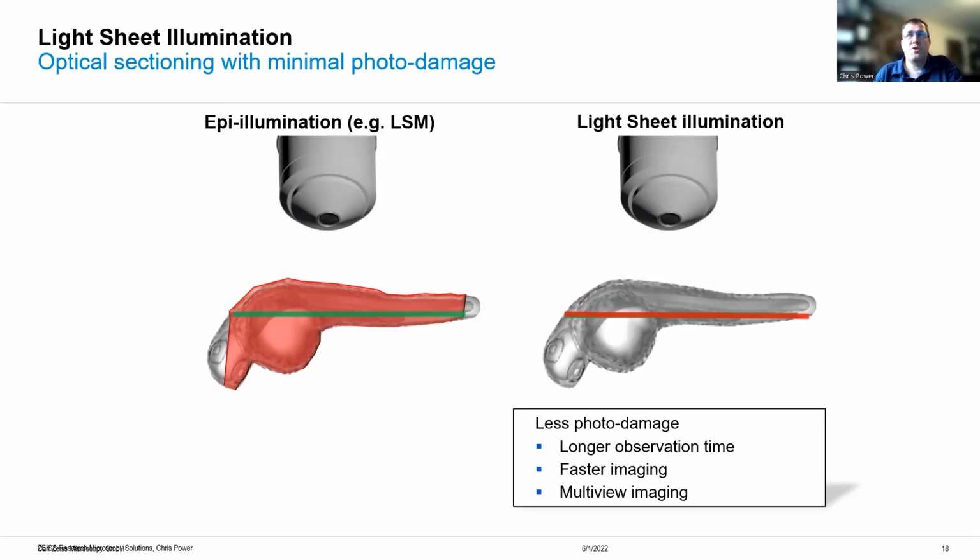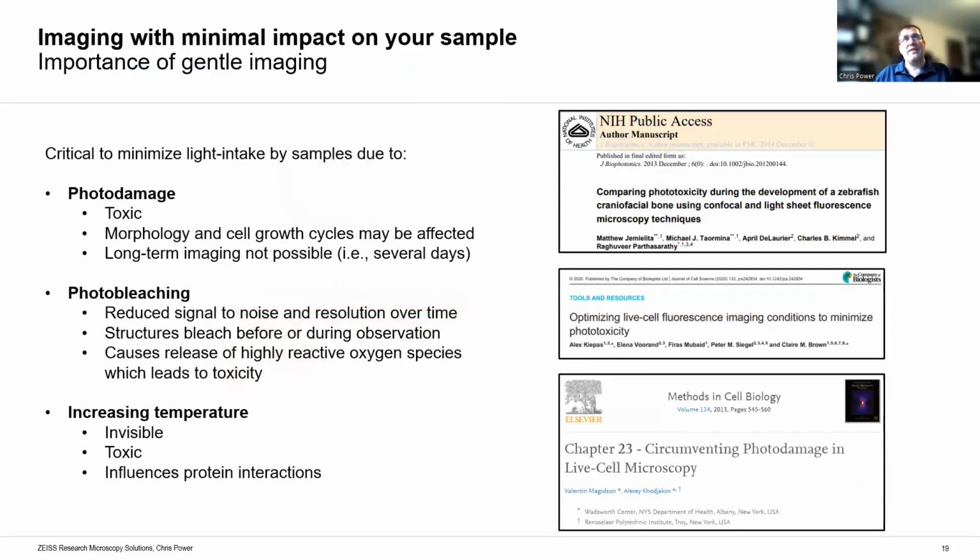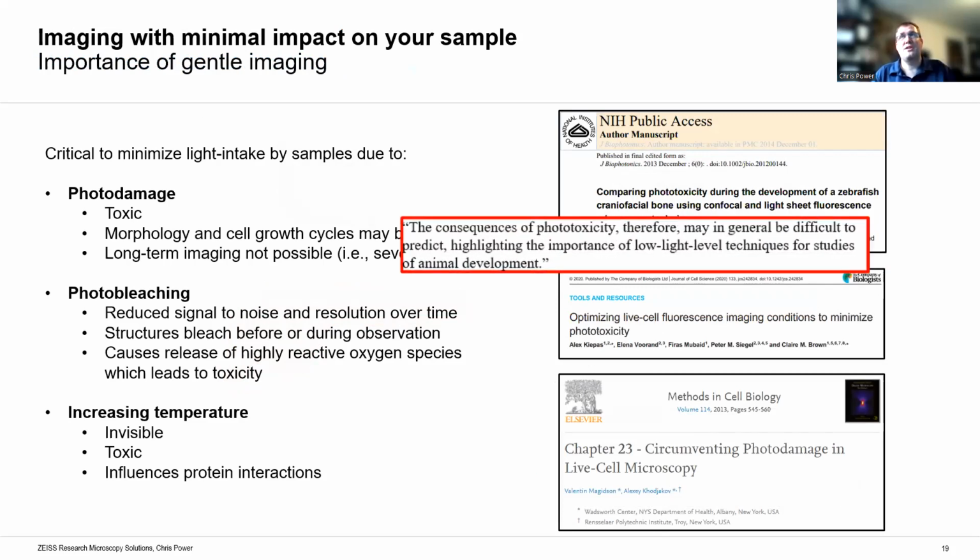That's one advantage. But the other advantage is how you get that light into the focal plane, or how you spread the light. And this is important because back 20 years ago, people cared about, do I bleach my sample or not? That was the key test in a confocal demo. This one bleaches 20%, this one bleaches 50%, 20% less, that's better. And if you didn't bleach, this was great. Nowadays, it's known that even outside of bleaching, you can still cause phototoxic, photo damage effects, particularly in live samples, even putting light in that doesn't necessarily bleach. So we want to be as gentle as possible.